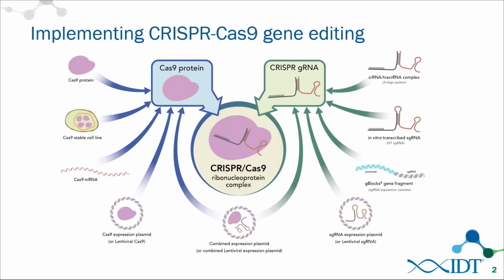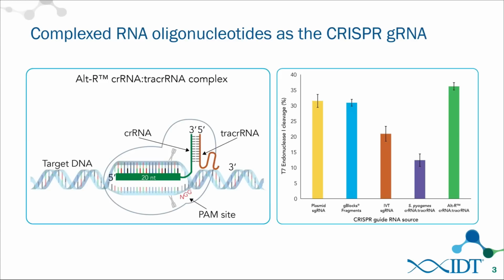And just to add to the complexity as you're thinking about experiments, there are all the options for delivering Cas9 as well as the guide RNAs, and we haven't even considered yet routes of delivery, whether it be viral or lipofection, nucleofection, microinjection, etc. So bear in mind, we're focusing here mostly on, first off anyway, the delivery of the synthetic oligonucleotides and development of that system.